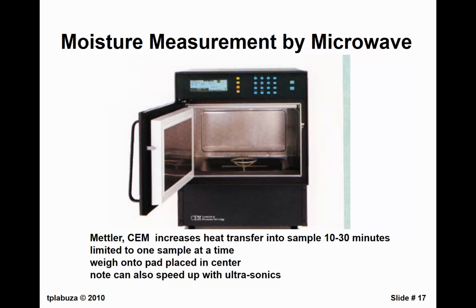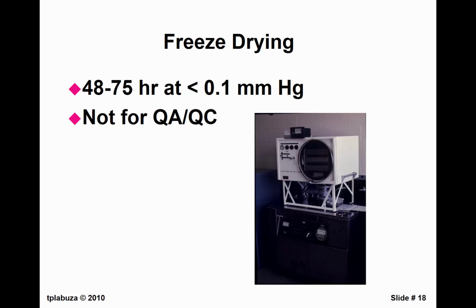What are your typical times for the stuff that you do for the microwave? It's 2 to 5 minutes, depending on the sample. Yeah, it would depend on the sample.